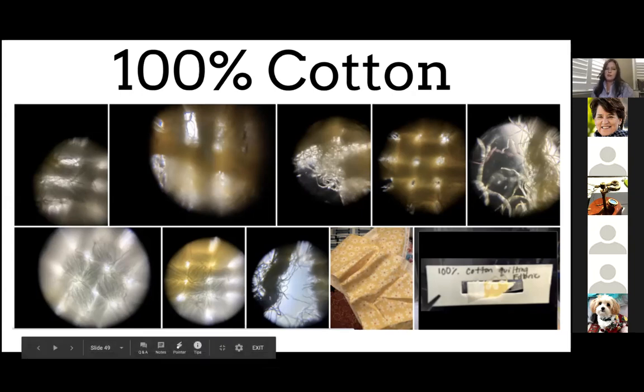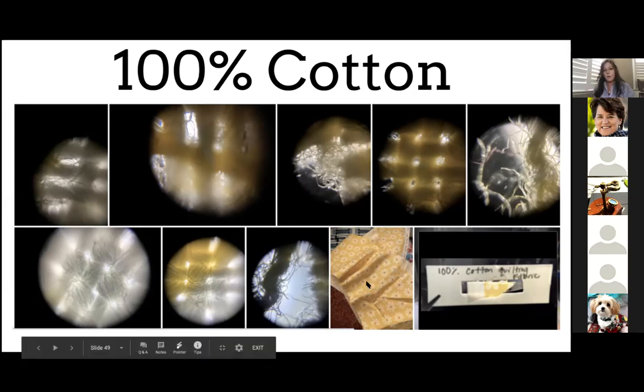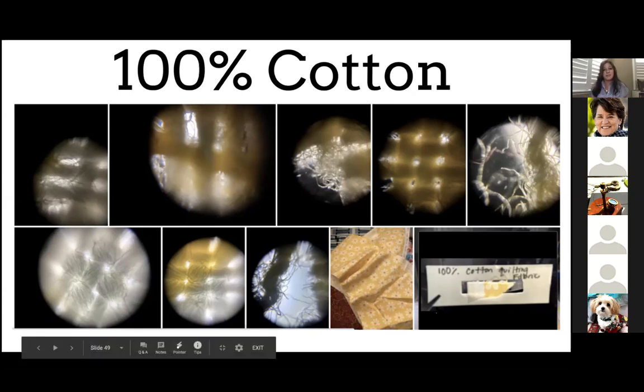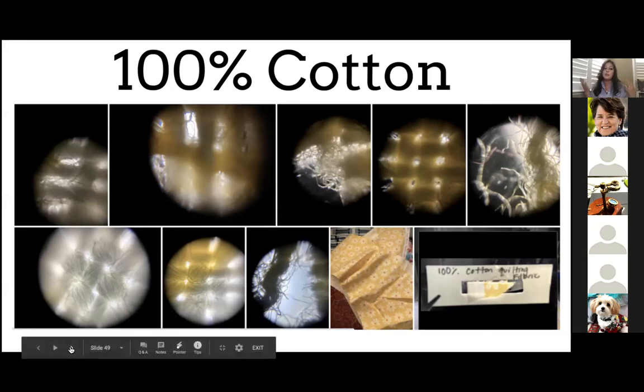So one of the things I like to do, so I don't forget what I'm looking at, is I took a picture just of the fabric. Plus I think it helps communicate to your audience, even if kids are doing presentations or creating projects for the other kids or for you. And then take a picture of what the slide looks like and label your slides. I highly recommend that. I was told to do that early on and I didn't. Now I do it all the time because it's very helpful, because you think you're going to remember what you made, but you might forget.